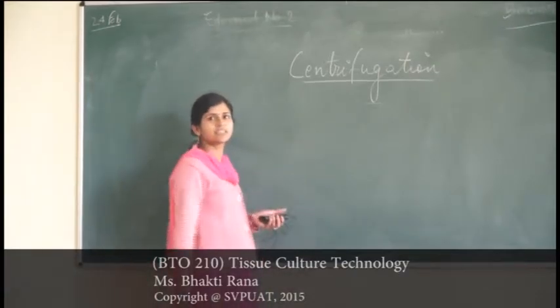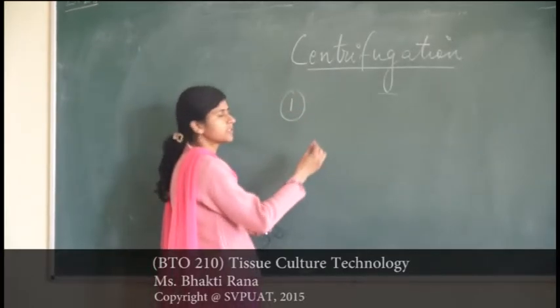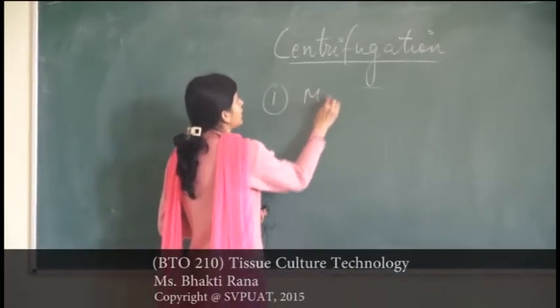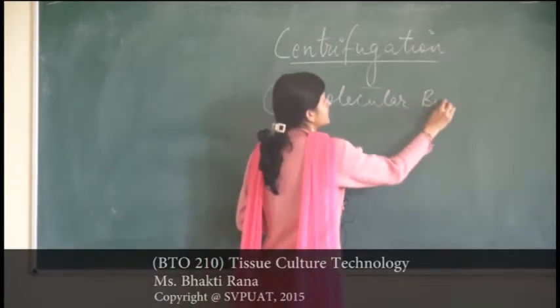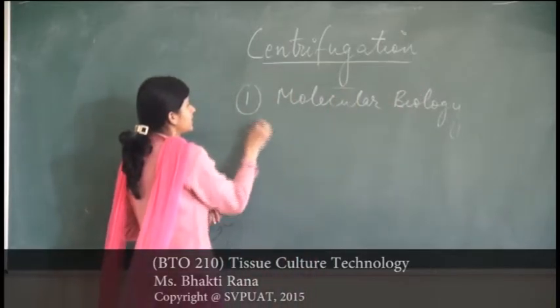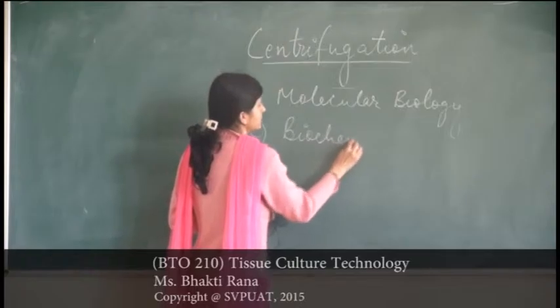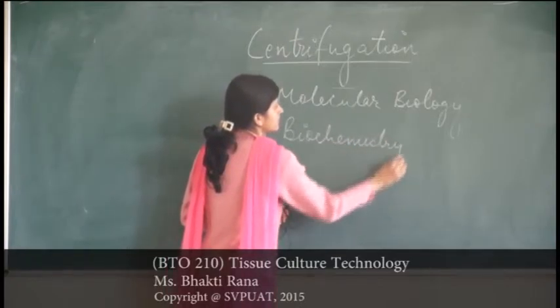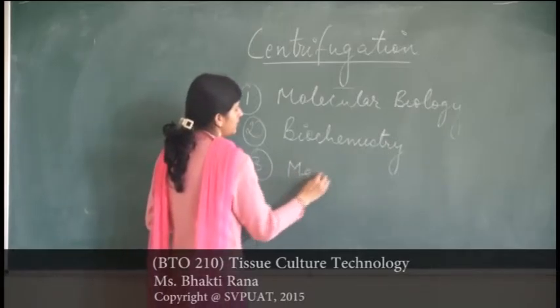Today we shall be discussing centrifugation. It is the most widely used technique in molecular biology, second it is also used in biochemistry, and thirdly it is used in the medical field.